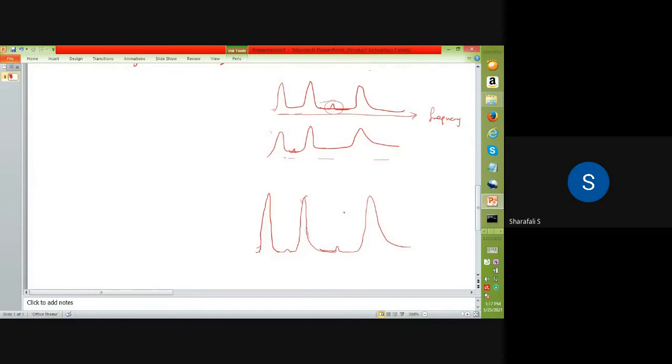So the advantage of taking the same experiment several times is that we can add up those intensities. When you add up all those intensities, our noise level will be getting very small as compared to the original signals or the spectra which we need. Okay, this amplitude will be large as compared to the noise. So then the signal to noise ratio will be improved in this case. Okay, so if you add these two, you will get it like this.